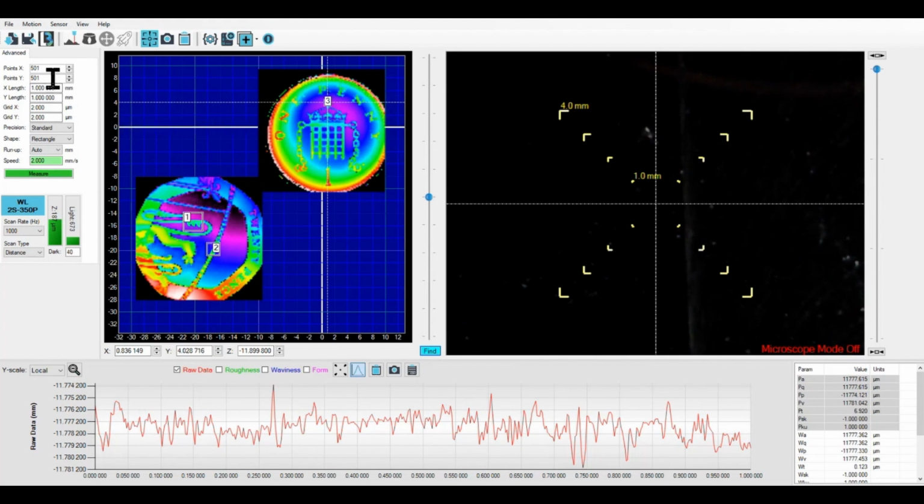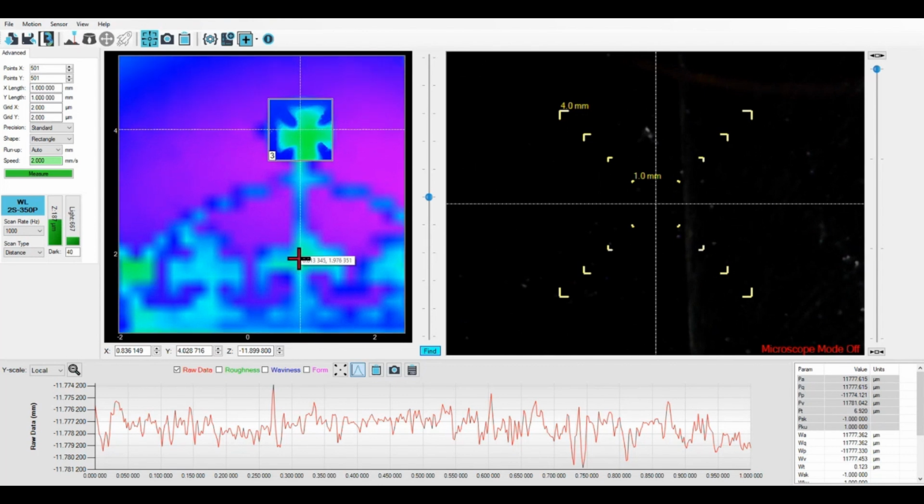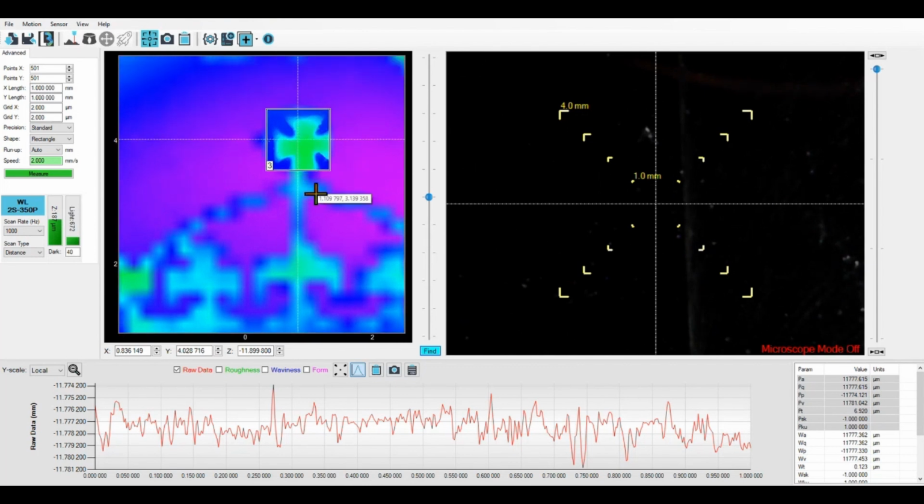And in each case, the number of grid spacings was always 500, so 501 by 501 data points, which gives us, in the case of the 3rd area shown here, we can zoom into that a bit, and we can see the detail on there now. Just zooming in to the image, we can see quite a nice image of that cross feature, and that's got a 2-micron spacing.